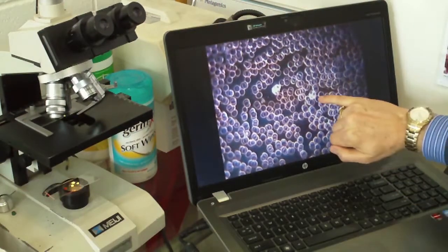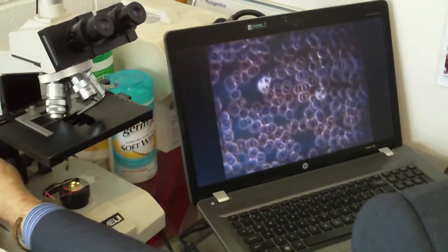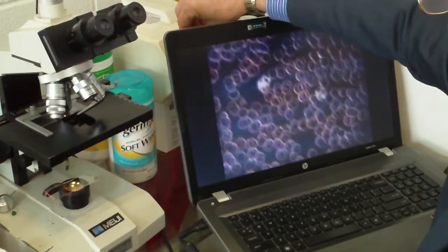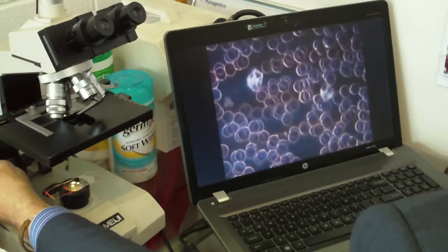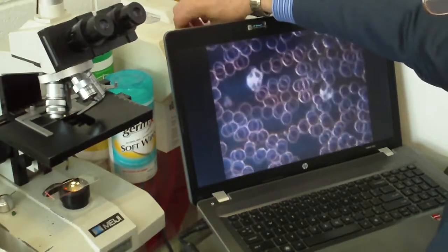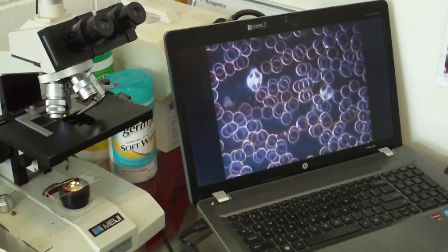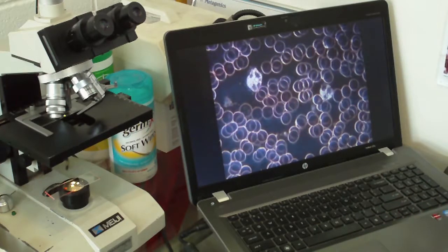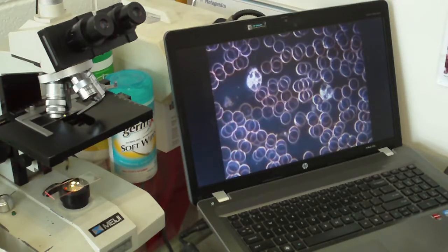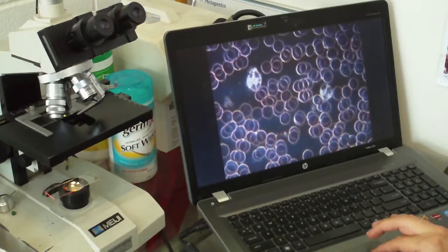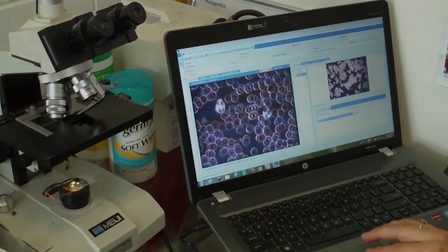So what we've got here is two white cells. Now there's five different types of white cells. I'm just going to zoom in on them and blow them up so you can see them a bit more clearly. They look like alien invaders in the blood, and they're not. They're part of your immune system. So these are neutrophils. Their main job is to destroy bacteria in the blood. It's normal to have them. They're the most ubiquitous or common cell in the blood, but it's unusual to have two in one screen. So it shows there's a mild immune challenge going on. So I'm just going to capture these.